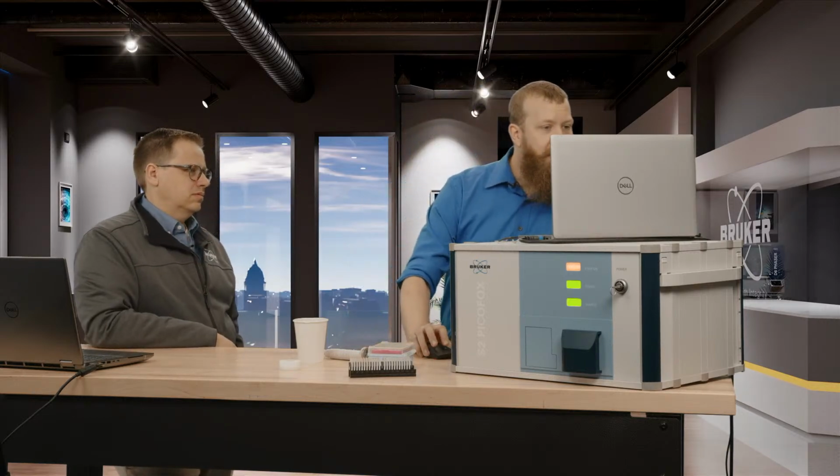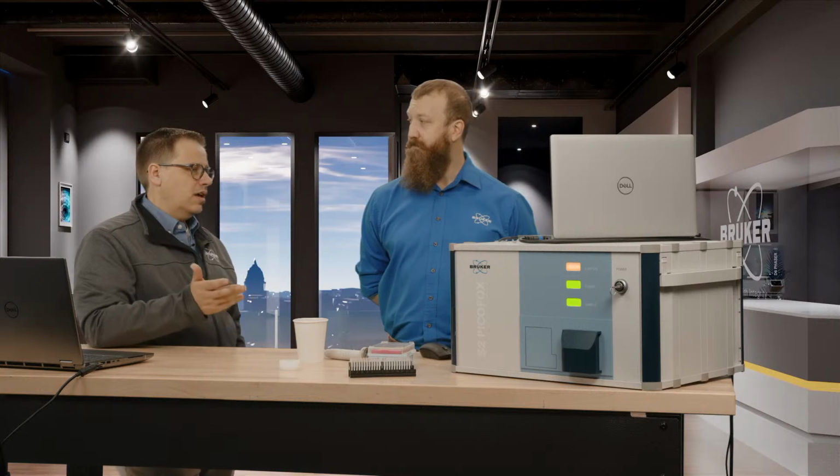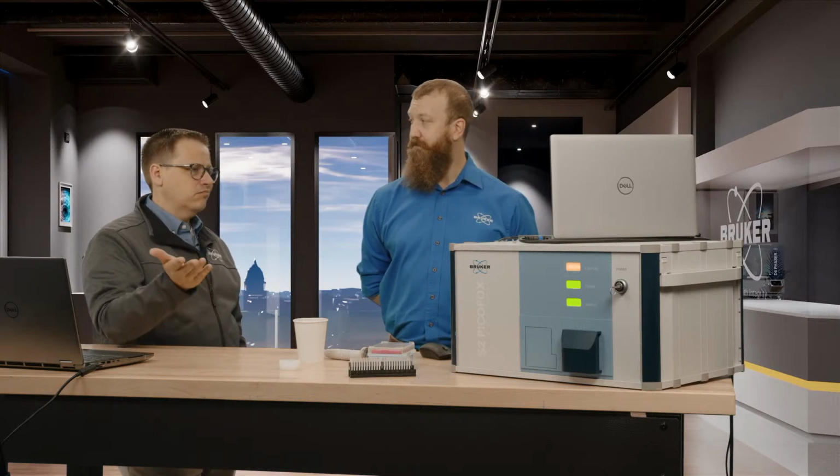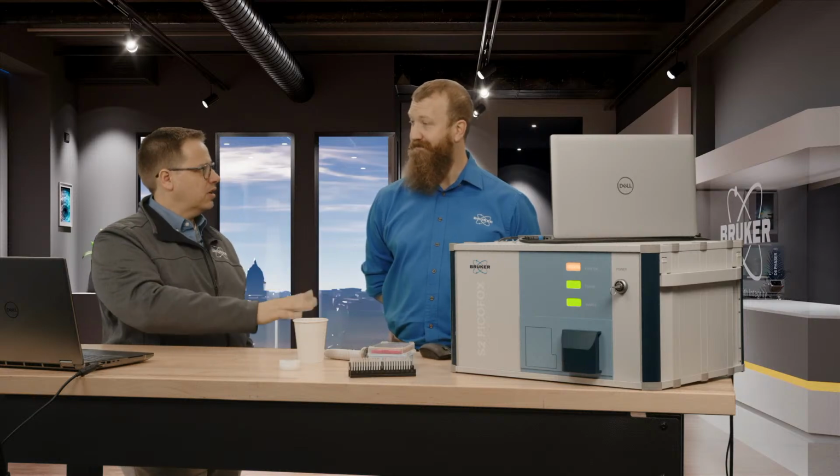All right, and how long did that spectrum take? This one I took 1,000 seconds. Okay, so 1,000 seconds, about 15 minutes, and sample prep time, 5 minutes, something like that. So 20 minutes, start to end, bam, you got all the results.